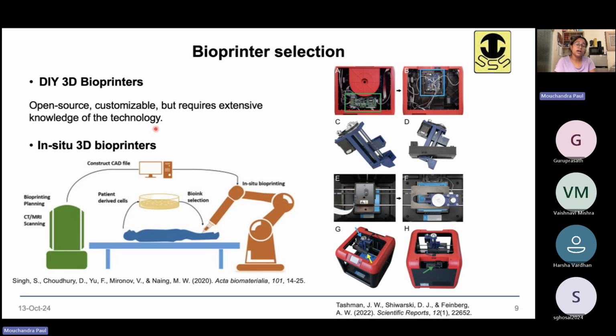So if you are ready to learn the entire process of making the machine and make it customizable, so whatever type of 3D printing you want to do, you want it completely customized, completely dismantleable, right? So that is a very good option, and it is going to be cheaper than buying a commercial one. But don't fool yourself, it will not be very cheap. It will be expensive, okay? It will be expensive as it is going to be used for research, but it will not be as expensive as purchasing a commercial one.